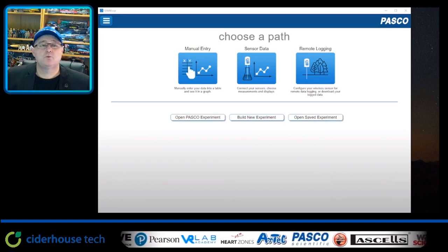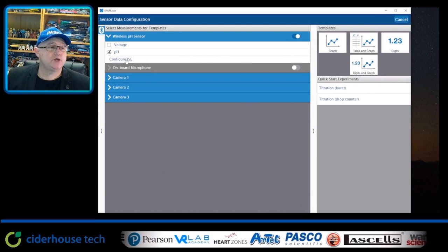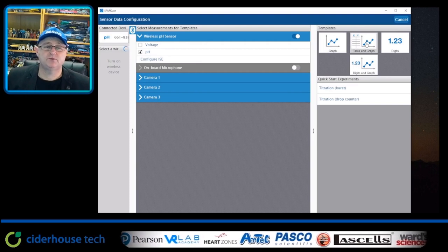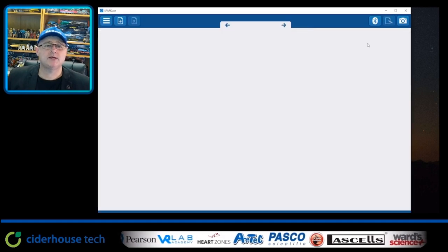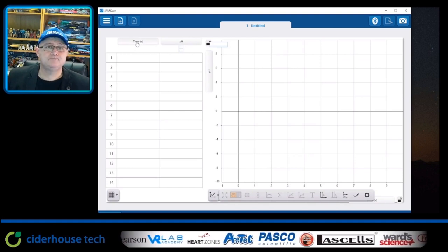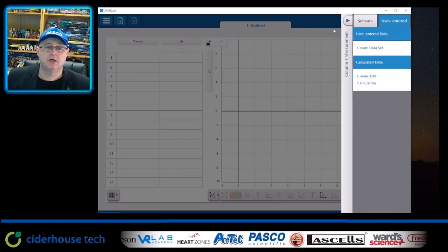Okay. So what we do is click on sensor data, and you'll notice that I've already paired my pH sensor. Now I've got table and graph, which is the middle one, and that's the one I'm going to choose. I click on that one, and that gives me the option. At the moment, it's time versus pH. Now, I want to change that. Time is not the issue here. I want volume. So I click on time, and then I use user entered. And from here, I create a data set.